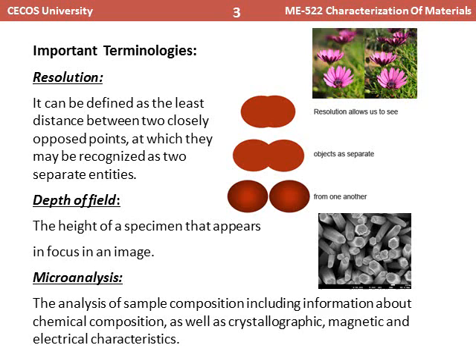The interesting thing that I have to share about SEM right now is that normal SEMs scan the object on the 2D scale. So by SEM we cannot see the objects in the third dimension. The third dimension is the depth. You can just visualize the surface of any object, not the depth.